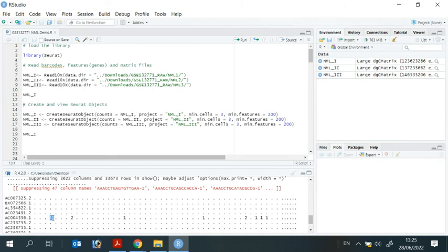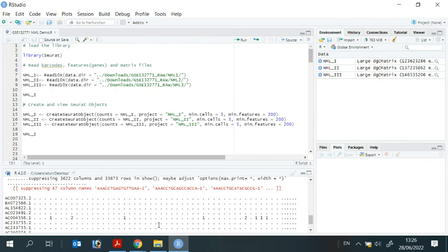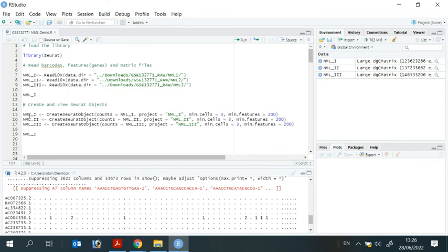Count one, for example for this one, means one copy of gene expression in this cell. If a gene is highly expressed in a cell, you will see a big number down here. So we managed to download and read single cell RNA sequencing data into R.